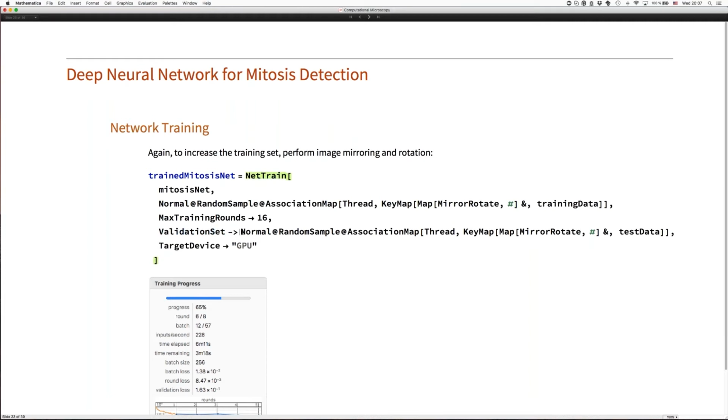You may wonder, what's a validation set good for? Well, essentially what I do here is fitting. It's fitting just like fitting a polynomial. The problem is I can, in principle, overfit. That means I can take bizarre properties of the data, maybe noise, and just make sure that my polynomial or my learned network reproduces that noise. But that would be overfitting.